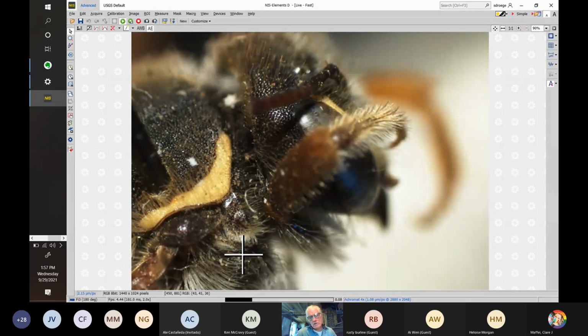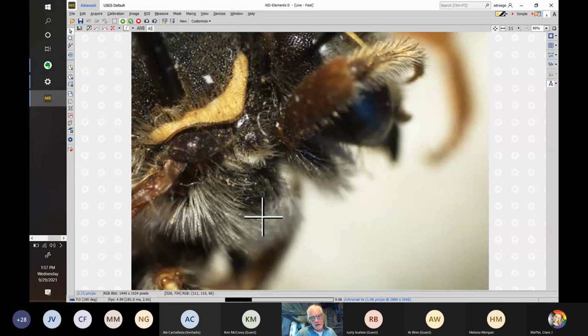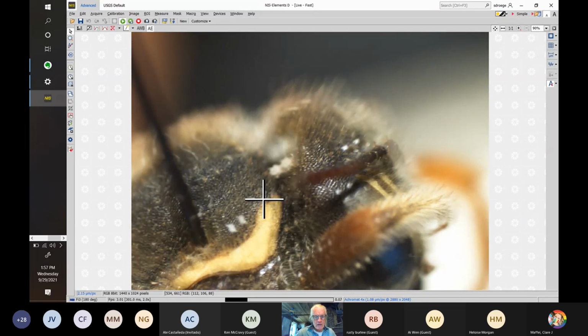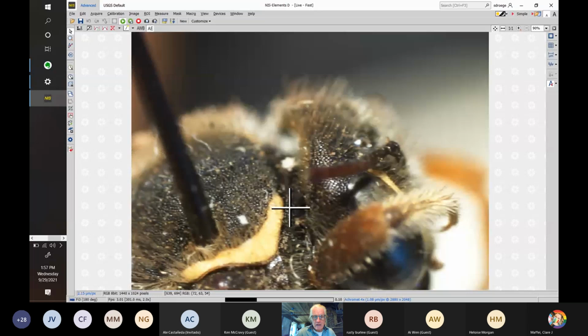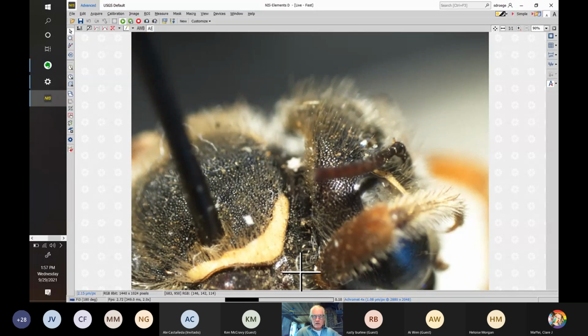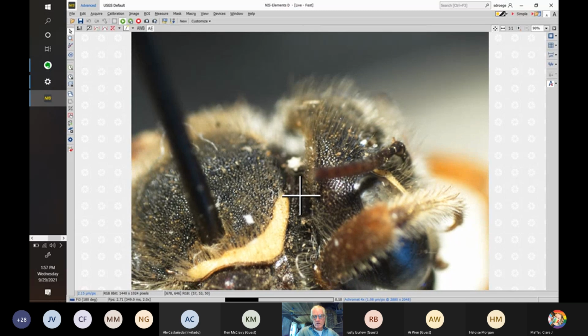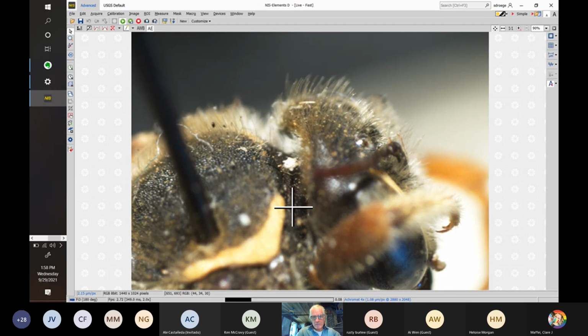All right, so we're looking for the transition between the front and the sides. I don't really see one. We're looking for the scutum diving in. This is the pronotal collar here. It's not a great look, but it seems to be basically merging. The end of the scutum is touching the end of the pronotal collar here. Maybe a slope, but we don't have that abrupt cliff face thing going on.